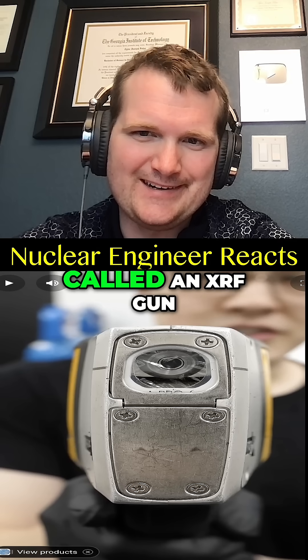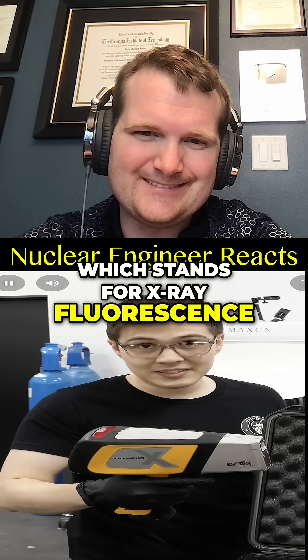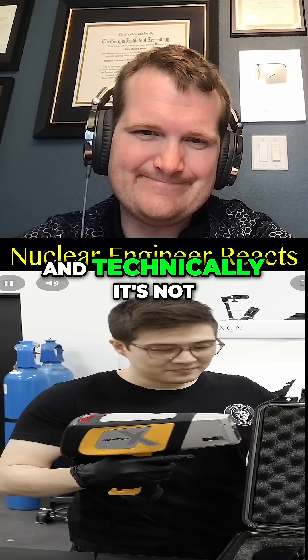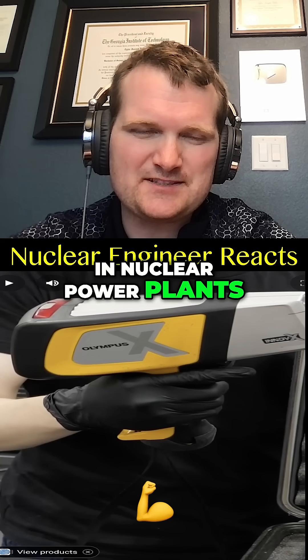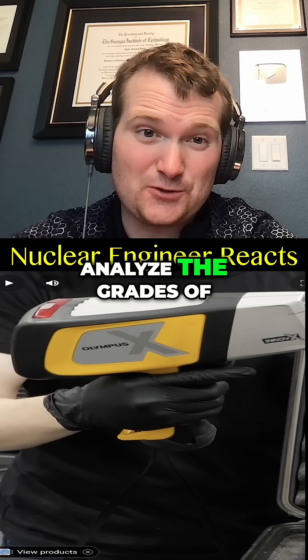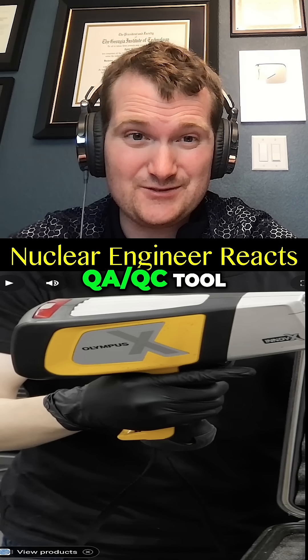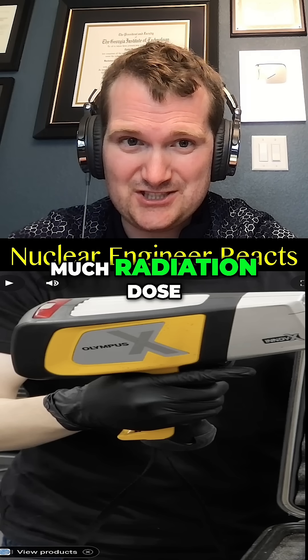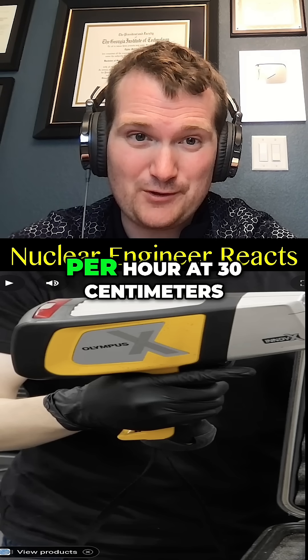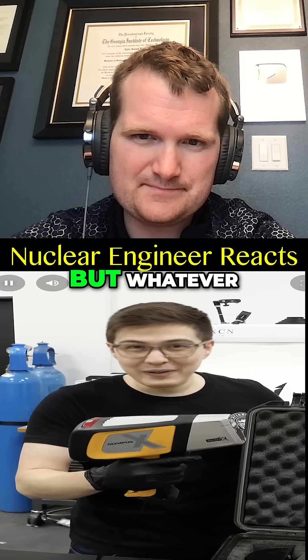XRF stands for X-Ray Fluorescence, and technically it's not called a gun — it's an XRF analyzer. At nuclear power plants we use these to analyze the grades of stainless steel. It's basically a QA/QC tool, and using this does not give you that much radiation dose — less than a microsievert per hour at 30 centimeters, which is less than eating a banana.